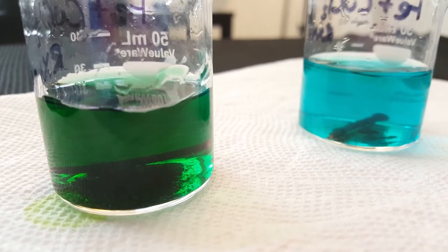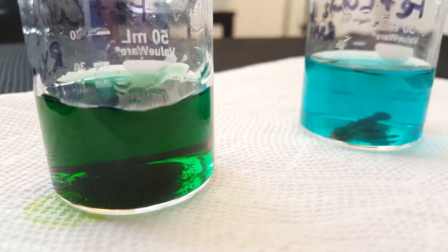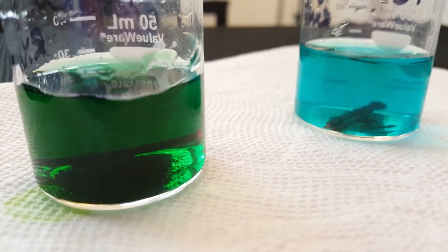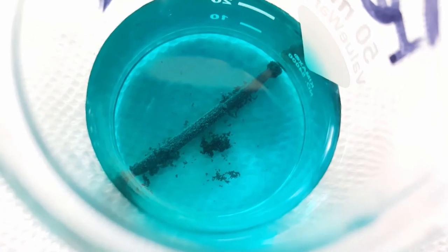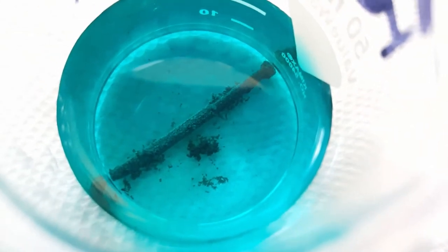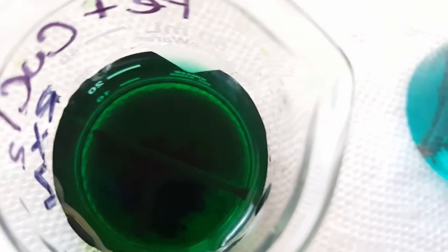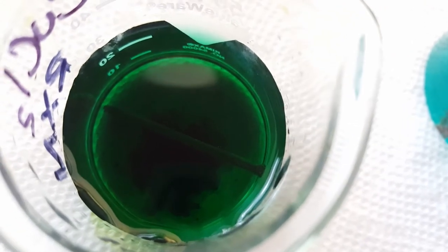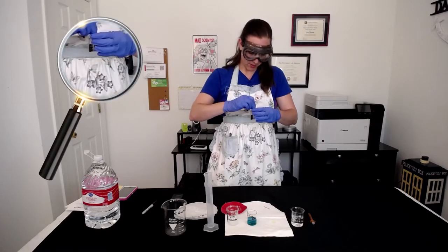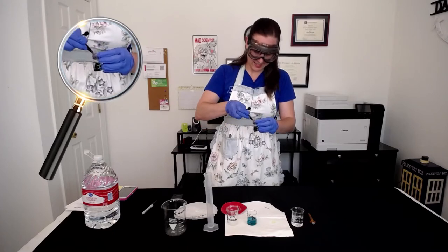We're going to take the nail out of this first reaction vessel and find its mass along with how much copper we've made. Just take a look at the difference in the color and how much copper has plated out at the bottom of the beaker. Remember that color change is an indicator for a chemical change — we know that in this reaction, the solution goes from this blue color to this nasty green color, so we know that a chemical reaction occurred. Using some tweezers or tongs, we're going to pull out our nail and scrape off what we can from the sides so that it stays in the solution.